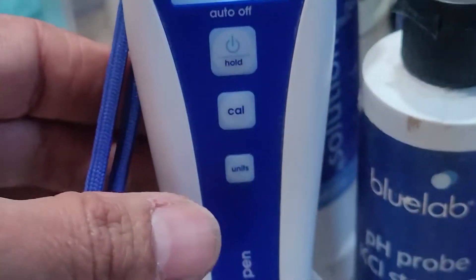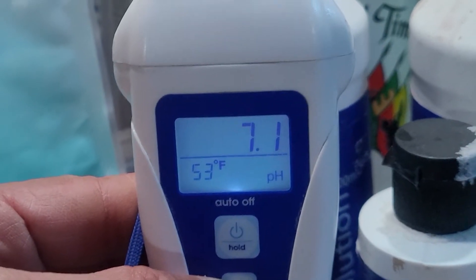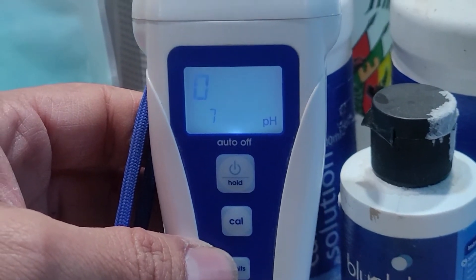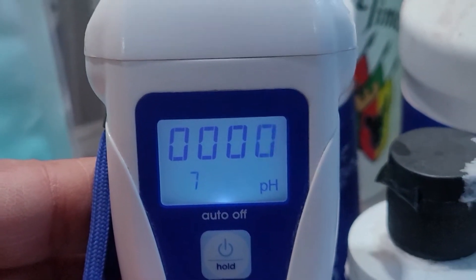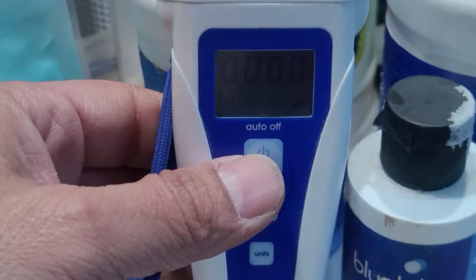Alright, this guy should be ready now. What is it holding? 7.1 — yeah, that's good enough. So we're going to hold the calibrate button, the middle button there. You're going to see it do a bunch of funky things — it's going to flash a few times depending on how old your unit is. It's going to blink, say calibrate, go through a couple zeros, might blink 7, might blink 4. Just let it roll, keep it in there.